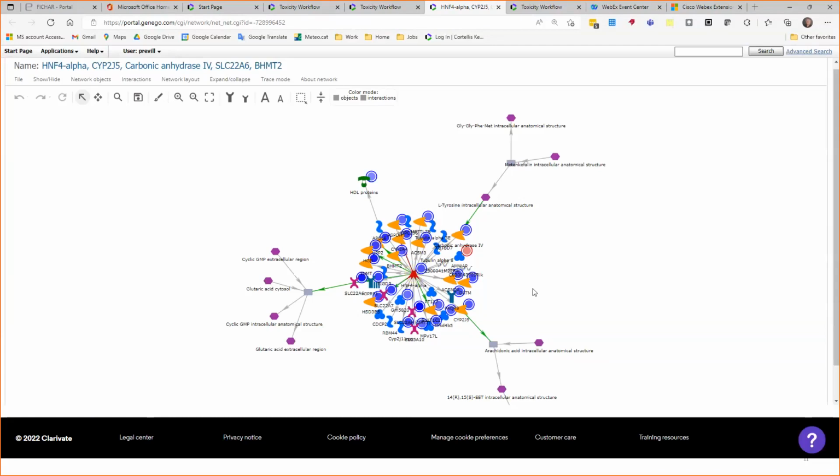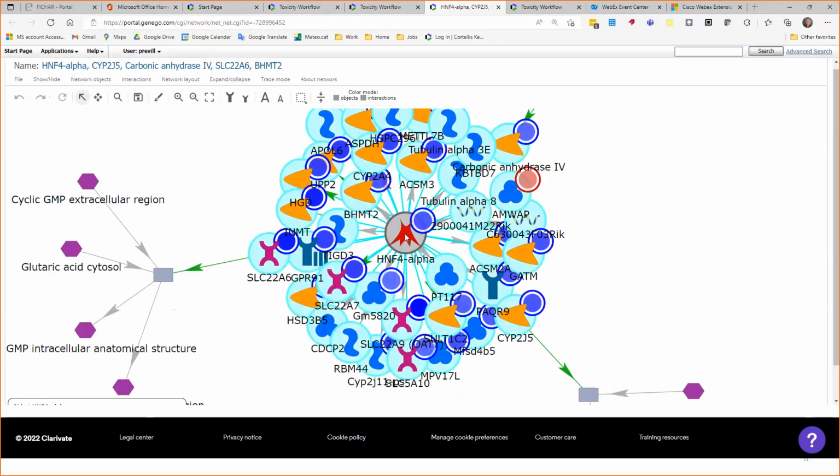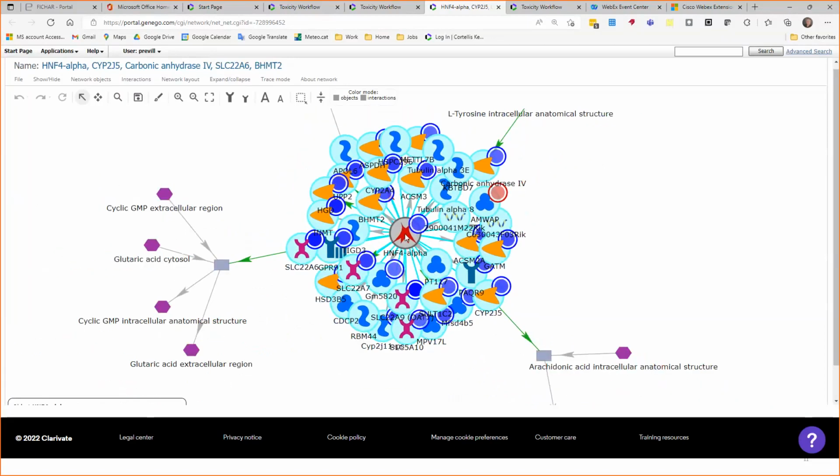significant interactions here. And you can see straight away from this figure that we have this key driver of all of these genes here. So what you see here is blue with blue indicators, and with a red indicator in this case, is over and under expression of all of these genes that are represented in our data set, and all of them being driven by HNF4 alpha transcription factor. So immediately from the analysis, we're beginning to draw some biological inference.